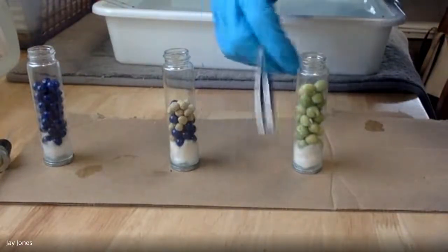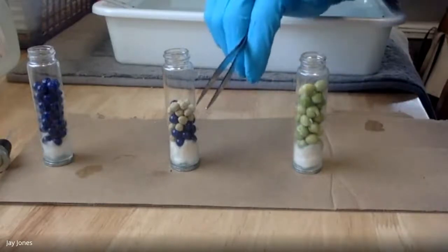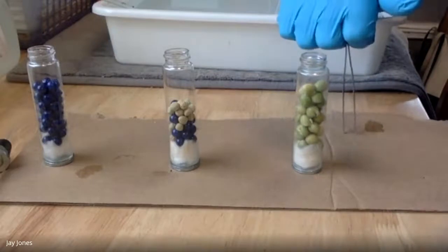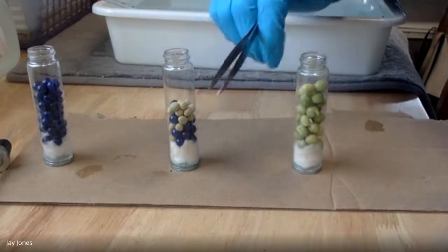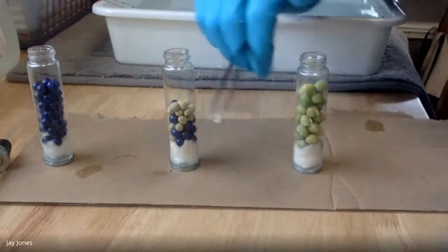Now I know it looks like the volume is different, but trust me, they're the same. This looks way less, but it's not actually. It's just because the surface area is so high here. There's a lot of space in between these. So essentially, there's 25 dry peas and 25 germinating peas, but they have equal volumes.